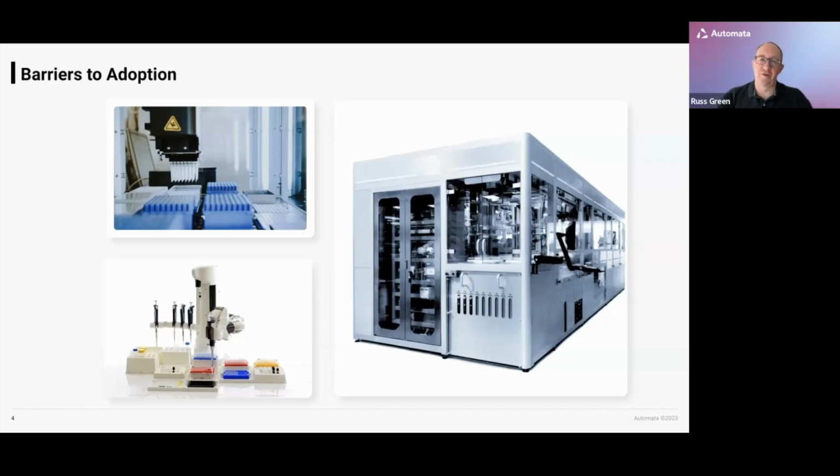But at the other end of the spectrum, most people's starting place for automation in the laboratory space is around liquid handlers. Let's face it, most life science activities involve moving liquid from one place to another. And so we tend to steer towards liquid handling as our first port of call of automation. And there are plenty of people that have had an experience of not getting that quite right, or hearing about people that didn't get that quite right at the outset.